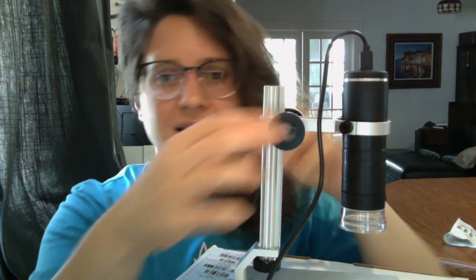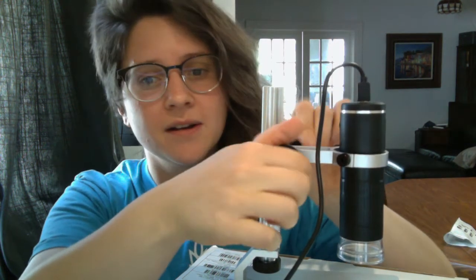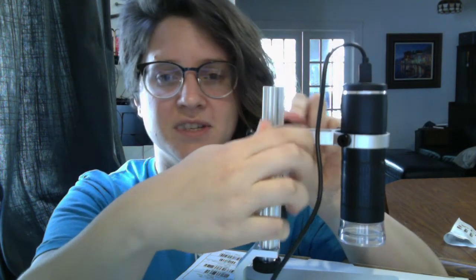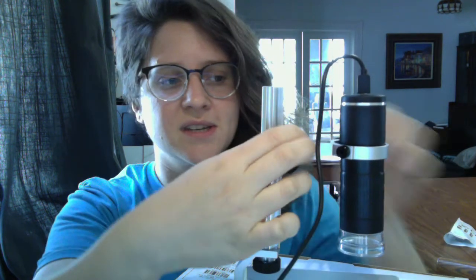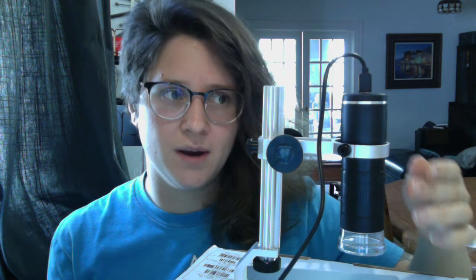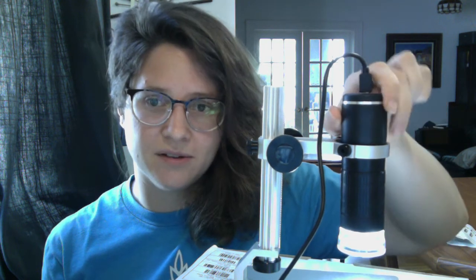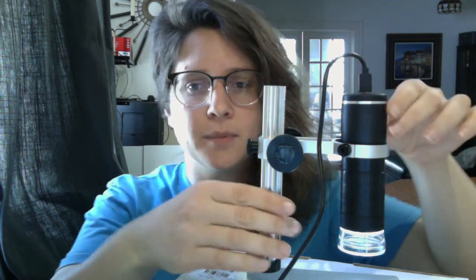Even though it's not as well-constructed as the Celestron, it basically doesn't feel like it's going to fall apart. You can raise it, you can lower it — it functions kind of like a stereo microscope. So this is really the coarse focus, and then, much like all these other models, you sort of have your fine focus right here. Your light is connected here, and there's a little dial that allows you to adjust the light. There are also a couple of zoom buttons right here.